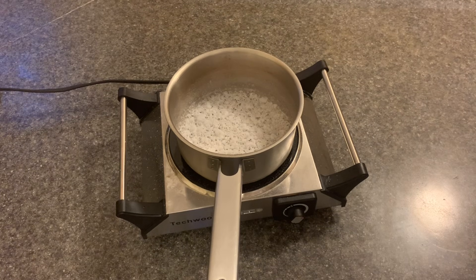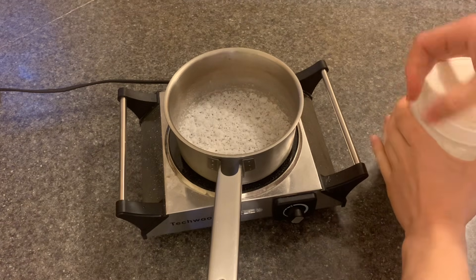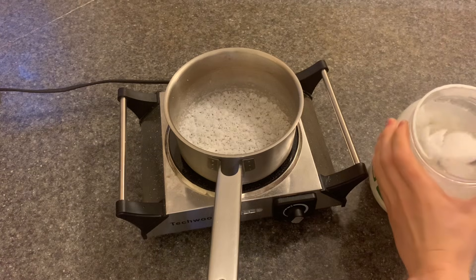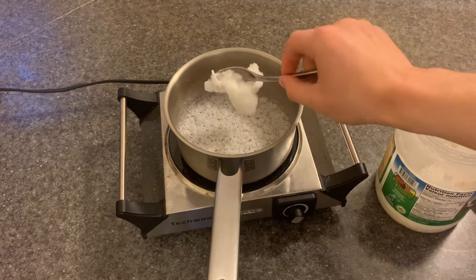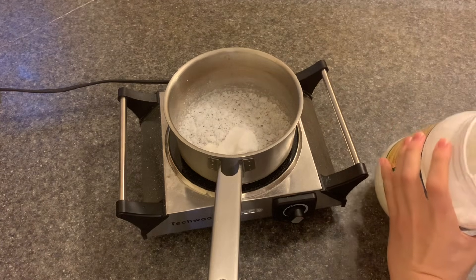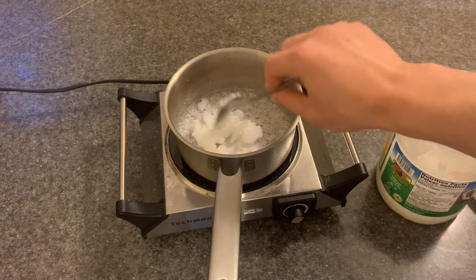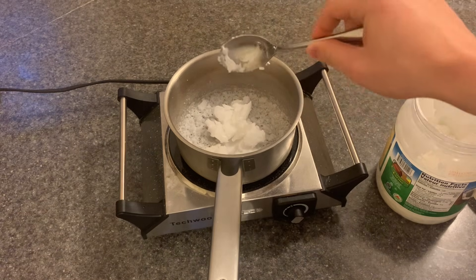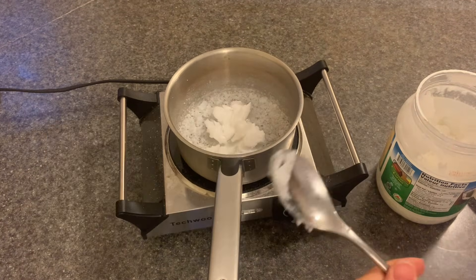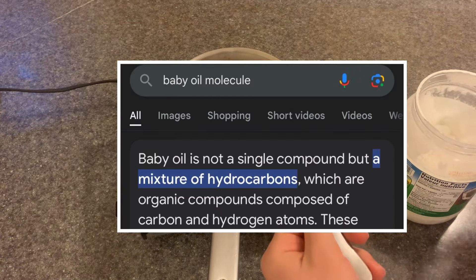Now that there's hardly any more water left, I'm going to get the coconut oil out and get a few spoonfuls of this stuff. You don't need much because not much sodium hydroxide was produced. I'm just going to dump the coconut oil in here. Theoretically, you can use just about any oil for this — maybe not motor oil or baby oil — but any cooking oil already works.